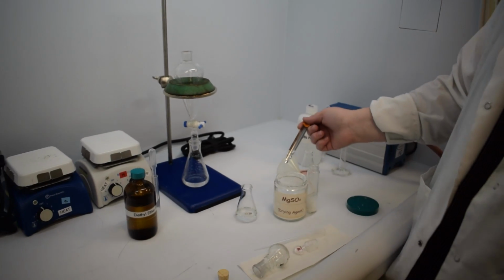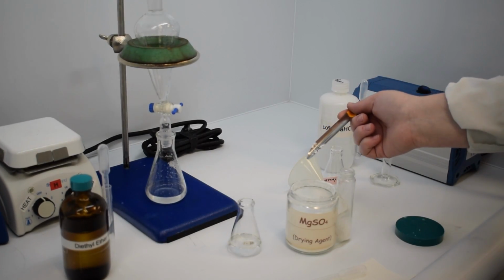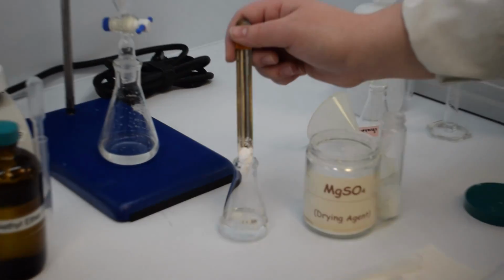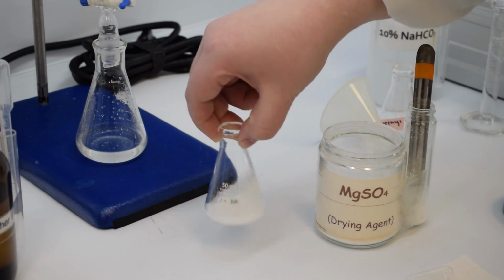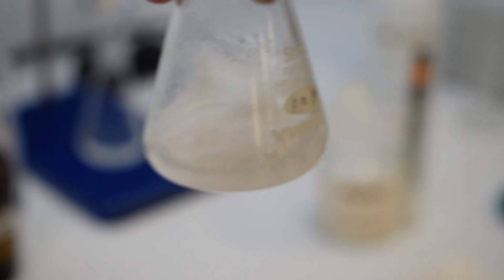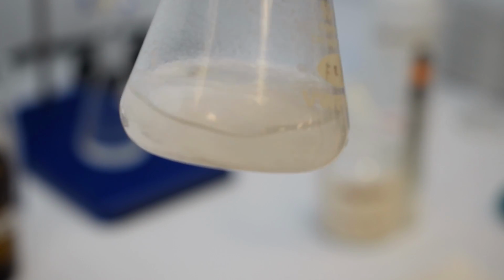In that 50 milliliter Erlenmeyer flask with the organic layer, we are going to add a healthy scoop of magnesium sulfate. The purpose of mag sulfate is to dry the organic layer. Now that doesn't mean we want it to be a solid, that means that it is removing any residual water that is in the organic solvent still. You should get this sort of snow globe effect when you have the right amount of mag sulfate in your flask.